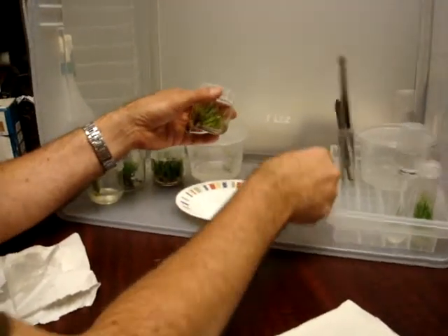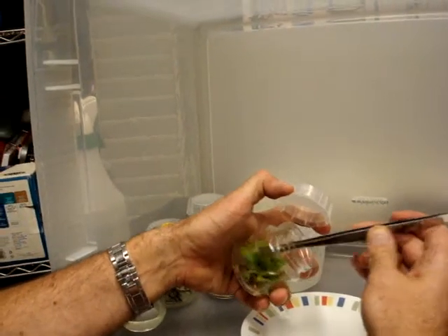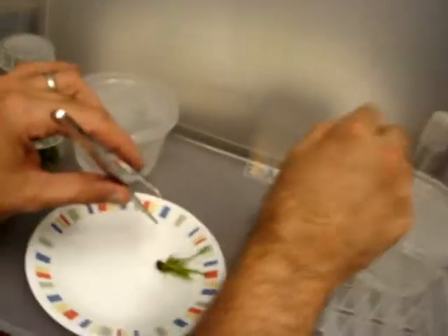And open the jar again. And again with the forceps, I will grab that plant piece out. There we go. Close the jar.